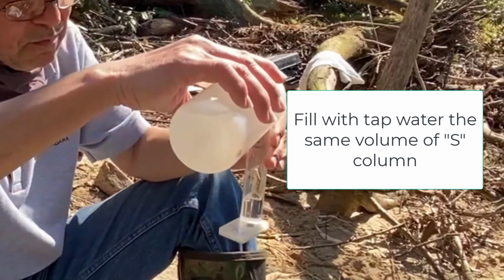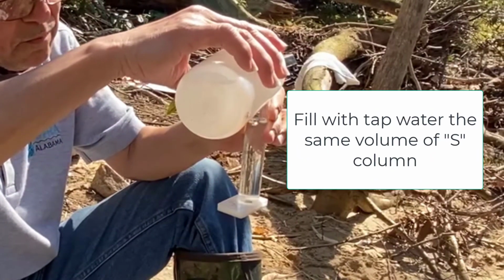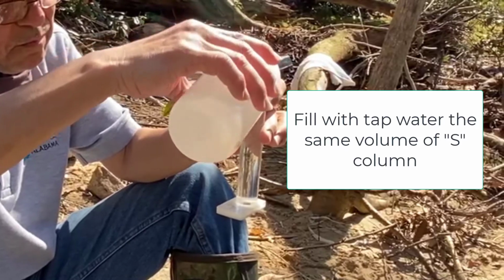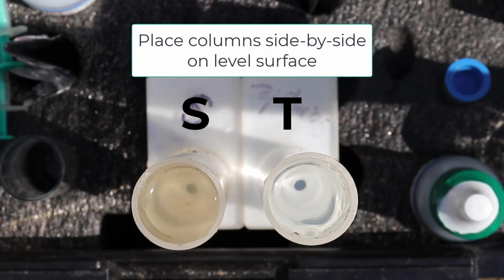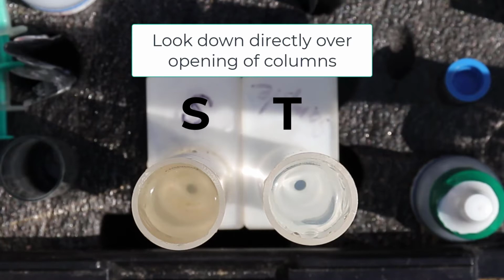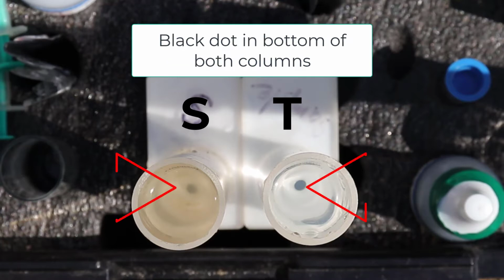Fill the second turbidity column with the same amount of bottled, distilled, or tap water. Place the columns side by side with the column bases almost touching. Make sure that they are on a level surface, like in the center of your kit. Position yourself so that you can look down into the columns through the openings, preferably from a distance of about 6 inches. This time, you should see a black dot on the bottom of both columns.